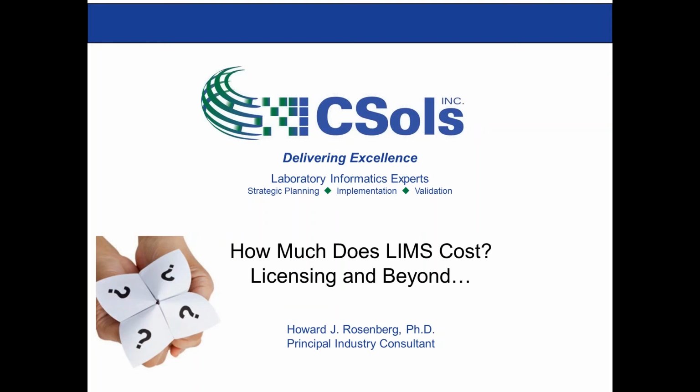We find that when we take a look at what people are looking for and searching for information on in the LIMS space, this question of how much does the actual LIMS cost comes up quite a lot, and so we thought we would go through some of this and the factors involved.